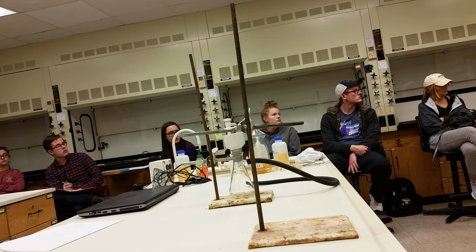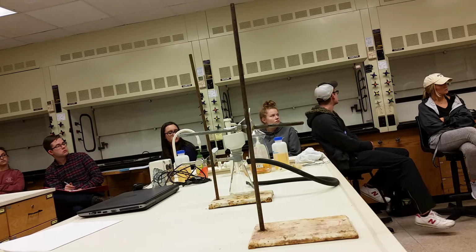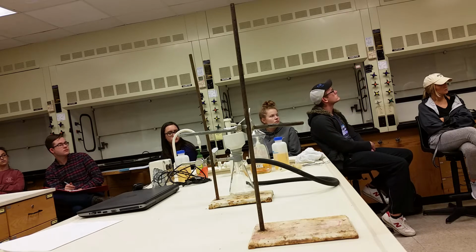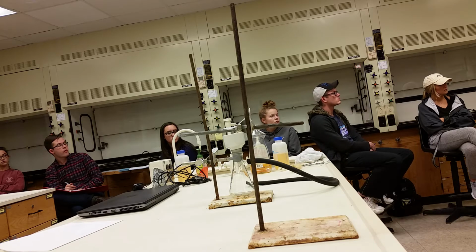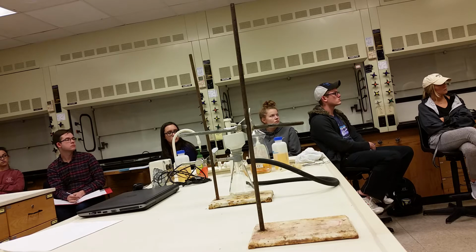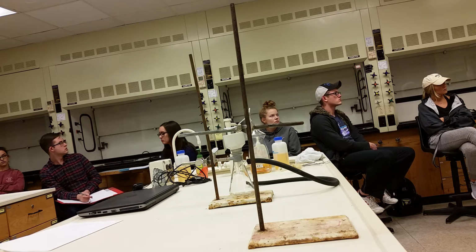You want to have the hood sash down, which means, I know you're all sitting very comfortably in your chairs, you want to actually stand at the hood. Pull the sash down. Keep your hands underneath the hood and open the vent so that it sprays. If there's any solvent in there, it'll spray onto the glass of the hood.